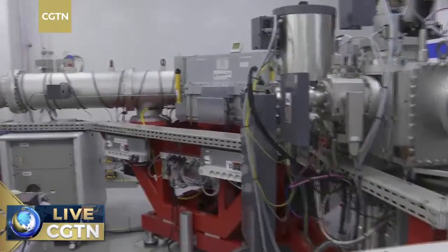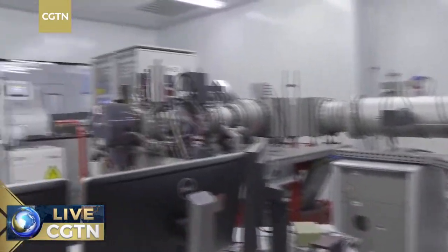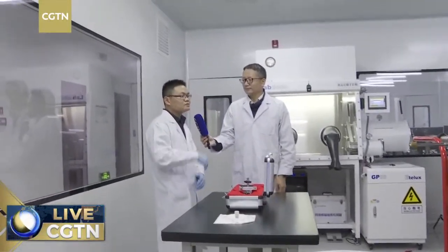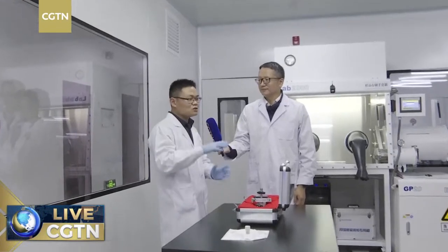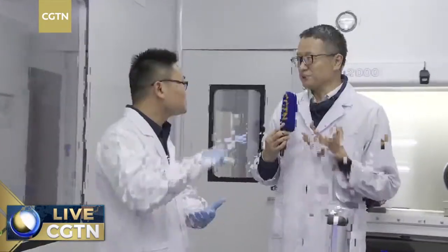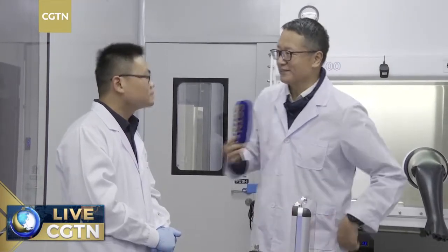How many hours do you usually work here? 我一般来说呢，如果这个仪器状态好的话，我们会24小时的工作。 You would take shifts with your colleagues and work here to observe, to keep close contact, keep some monitoring of the lunar samples, right? Yes.